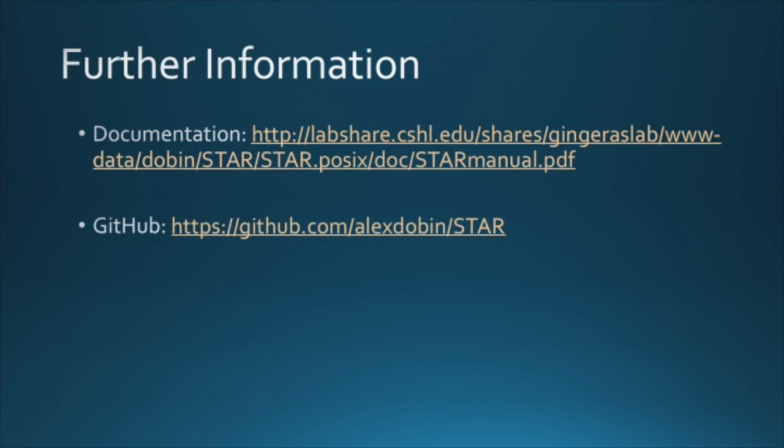For more information about STAR, including information on advanced features and troubleshooting, the best place to look would be the official documentation for the software. We included the link here in this video if this is what you're seeking. A link to the GitHub repo for STAR is also included and contains the most up-to-date information about installation, documentation, and actual source code.